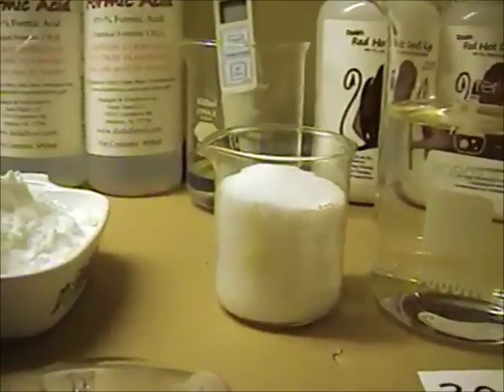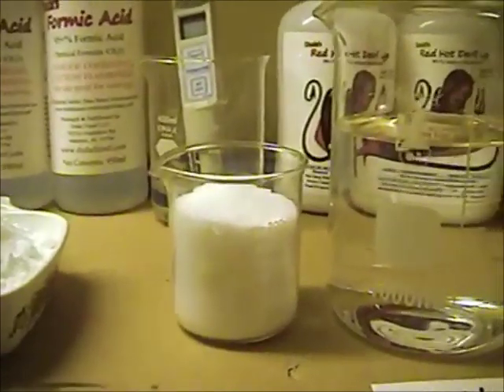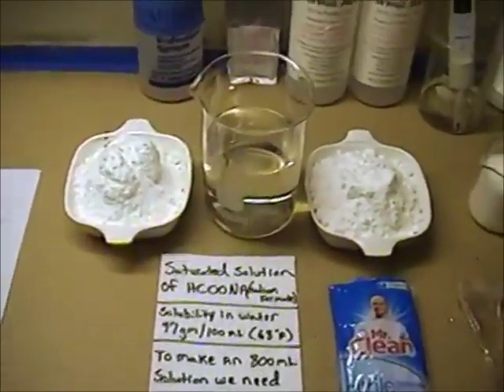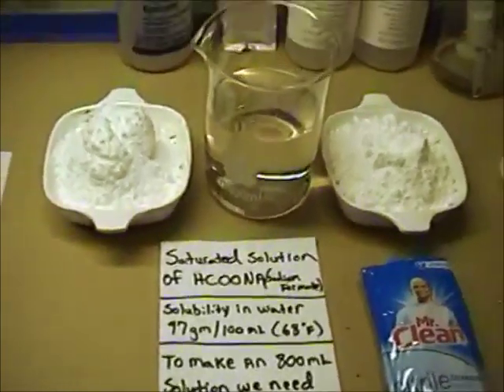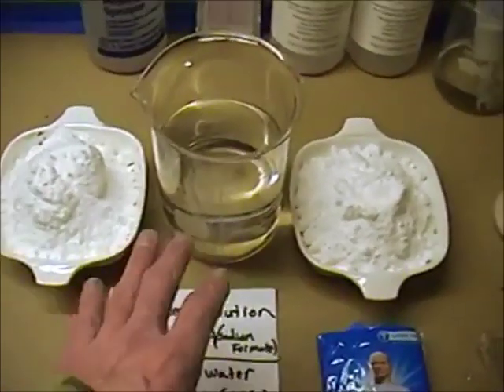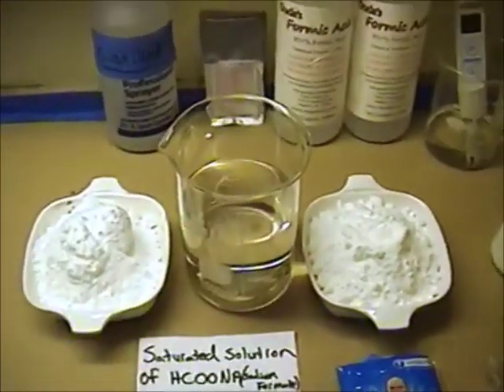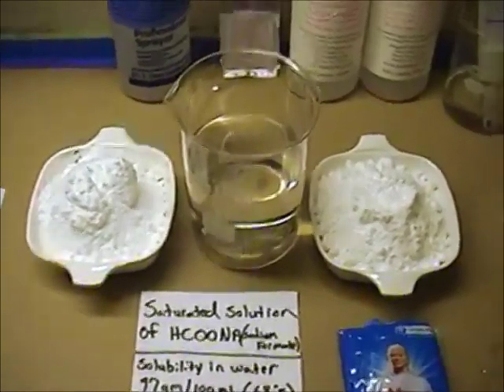So, as you can see, we're going to dissolve this into that. And the reason I'm showing you what the volume size of it is, when we move over here to the sodium formate, I want you to notice how much sodium formate I have for the same 800 milliliters of water, which tells me that this is very soluble in water. And this is sodium formate. This is formic acid. We're going to use the formic acid to adjust the pH of our sodium formate solution before we precipitate our silver nitrate with it.